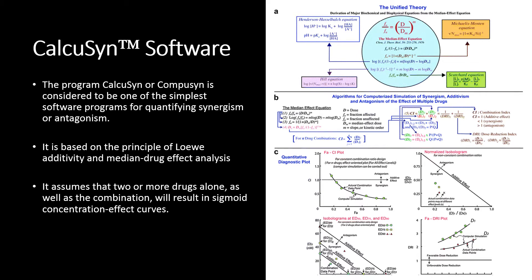In this video, we will demonstrate how to use CalcuSyn software to analyze combination studies with a fixed constant ratio or a non-constant ratio, with simultaneous drug exposure or sequential drug exposure schedules.